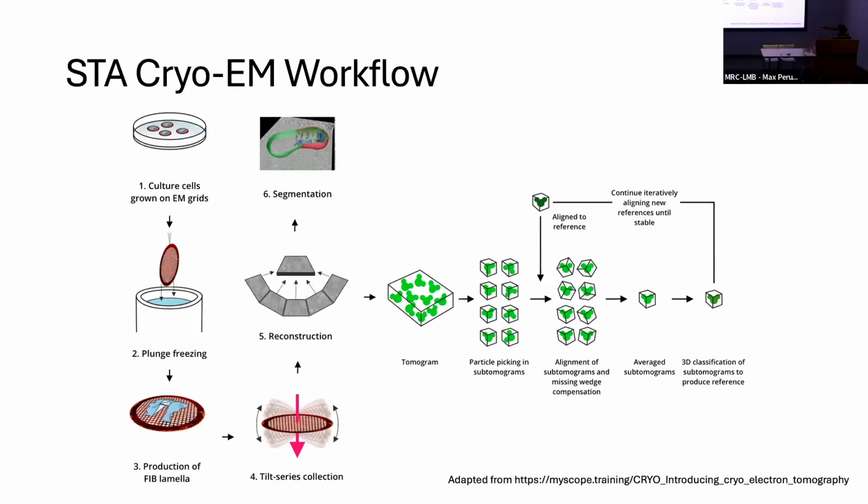But if you want to see more clearly what is inside, this one is a mitochondria, I'm not sure, I cannot really see it. Then you can use the single particle method to average, cutting individual particles out from here and here, then alignment and projection back. This is called sub-tomogram averaging.